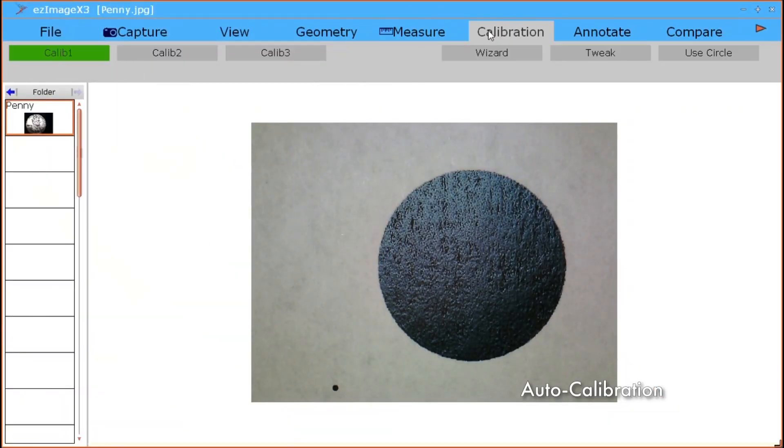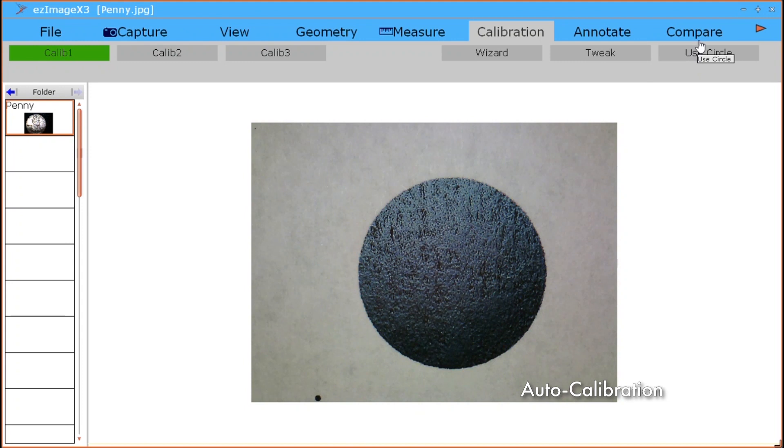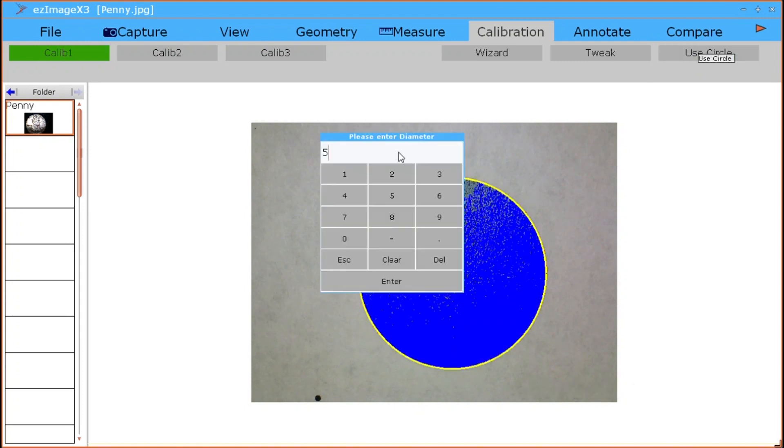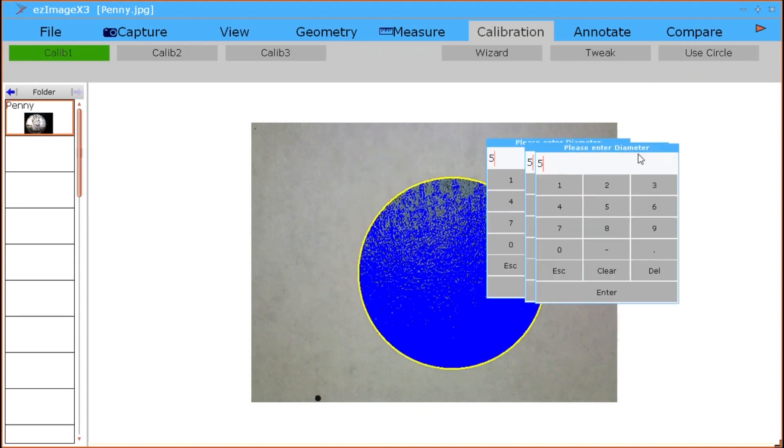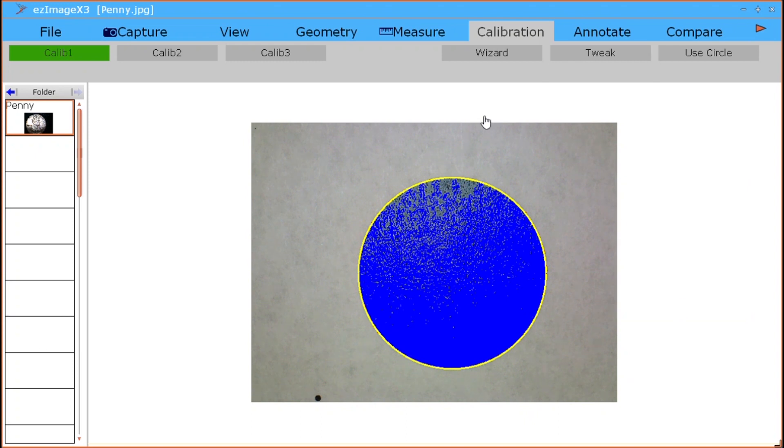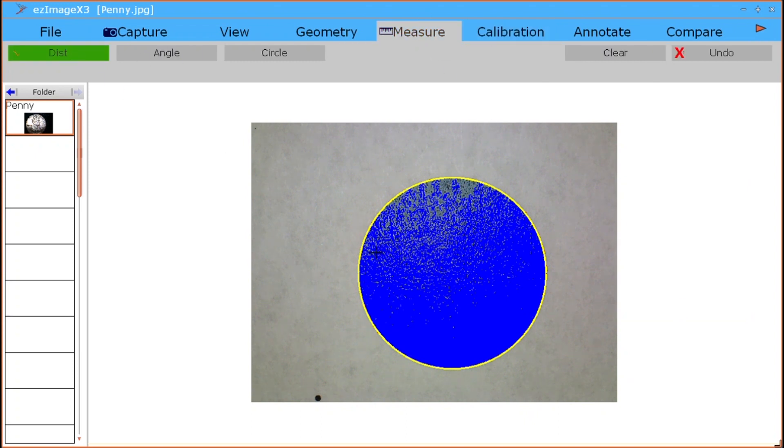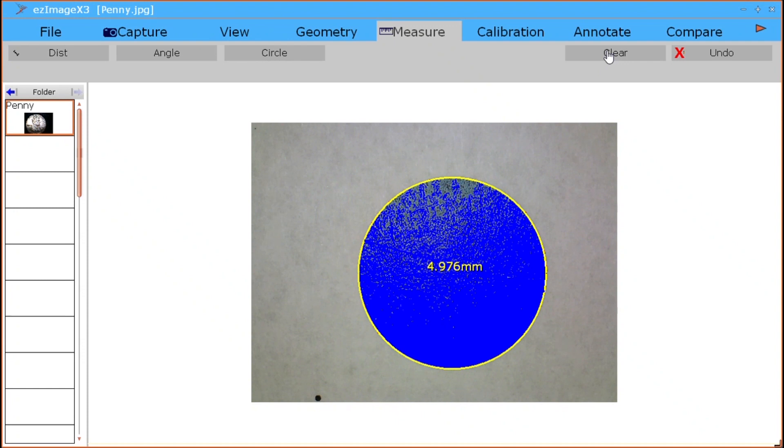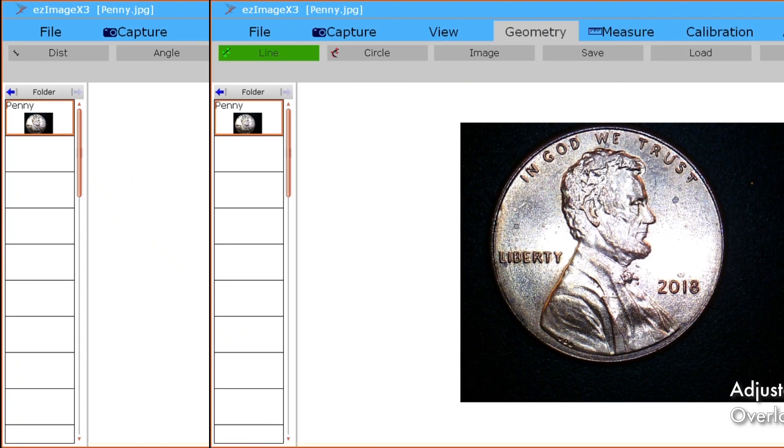Easy Image X3 has the ability to detect circle shapes for auto calibration. Simply place a printed circle underneath the Mighty Scope or other compatible camera. Once the circle is detected, a prompt to enter a measurement will appear. Simply type in the correct unit of measurement, and Easy Image X3 will be calibrated.